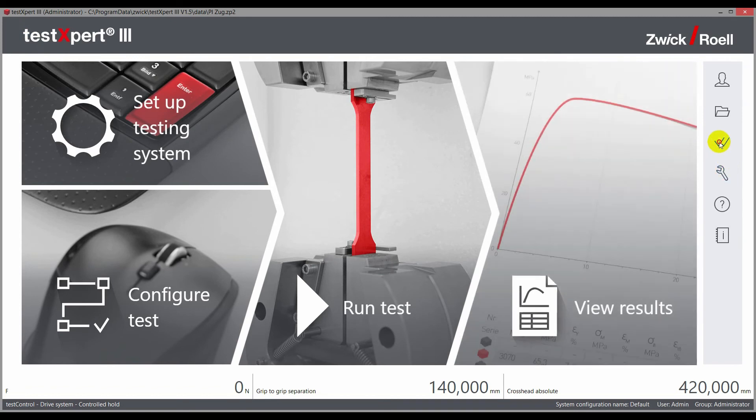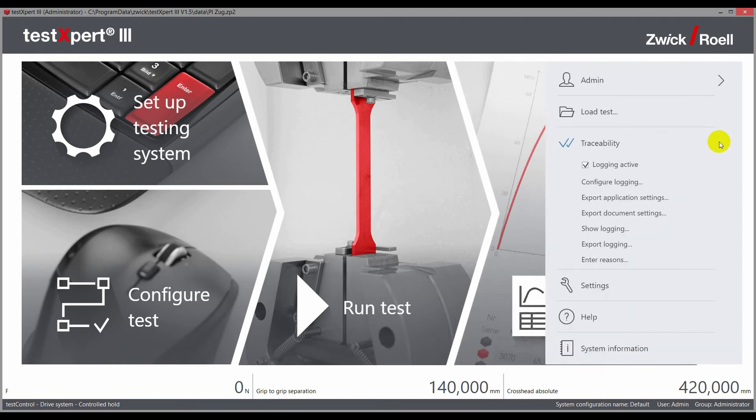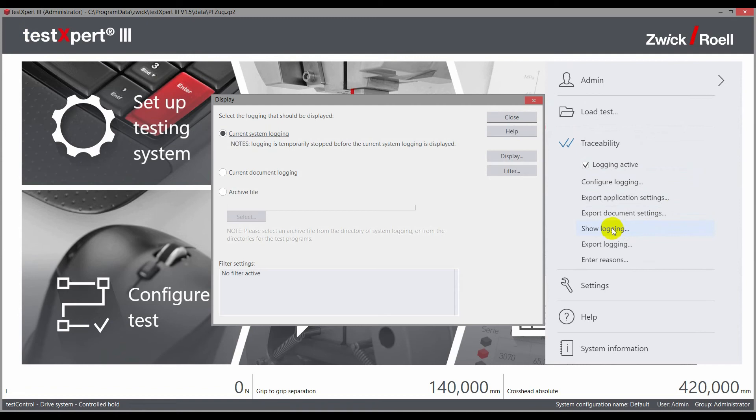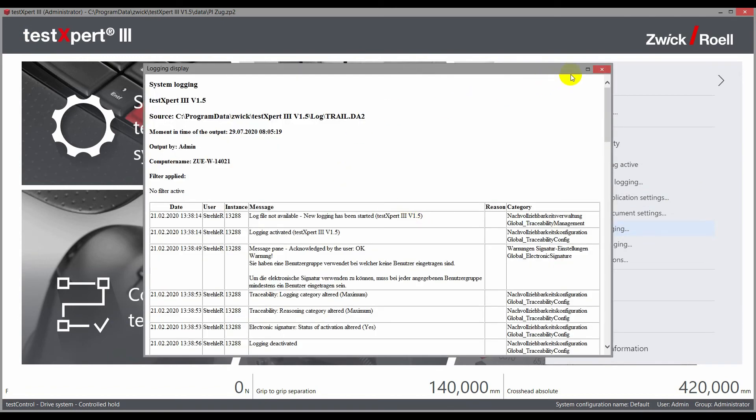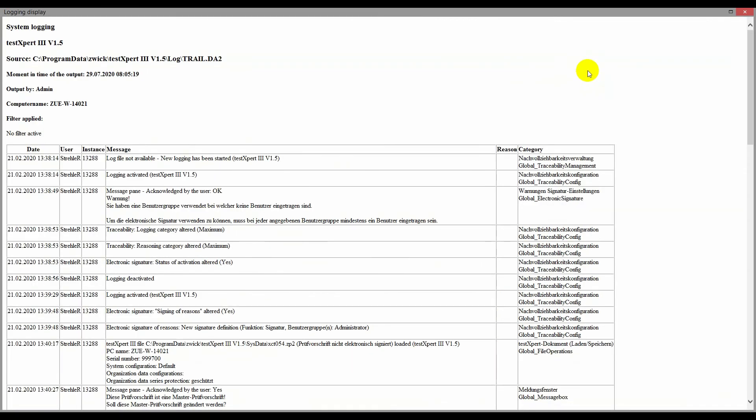Back on the home screen, the administrator can view the loggings. In the first step, the so-called system loggings are displayed, which present all administrative and higher level actions in TestExpert 3.